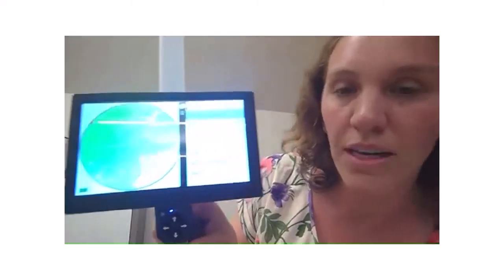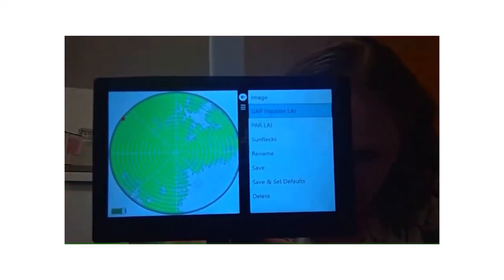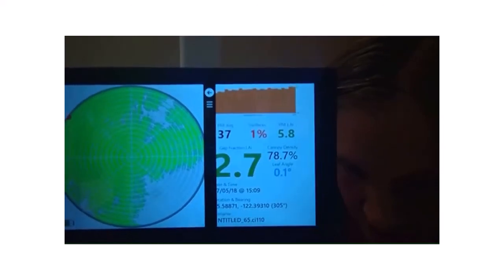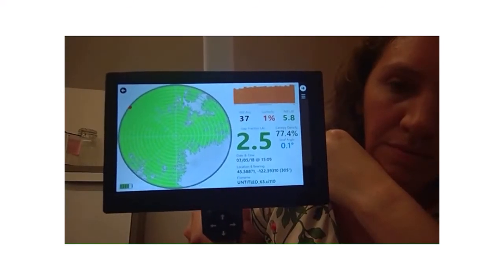That's really helpful. Would tweaking any of those threshold values you were talking about help? Yep. Again, you can adjust this after the image has been captured. That's a really useful tool, right? You don't have to lock yourself into a particular threshold. You can play around with those threshold settings after the image has been captured, and you do that in the same menu. Gap fraction, LAI. You just go into that menu there. There's the thresholds menu. And if you wanted to apply Otsu, you just right click and it's going to adjust your image accordingly. So is that the thresholds which determine whether it sees it as sky versus canopy, essentially? Yes.